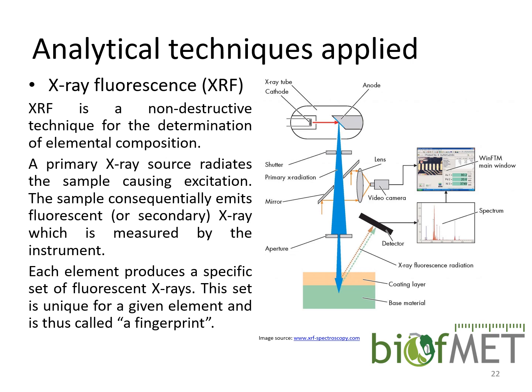So this is the main principle, and all these X-ray fluorescence techniques can be divided into two subgroups: energy dispersive or wavelength dispersive. As I already mentioned, energy dispersive X-ray fluorescence will focus on the energy of the fluorescent X-rays, so the measurements will be done in, for example, electron volts. For the wavelength dispersive, you will be focusing on the wavelengths of the X-rays, and that will tell you something about the identity of the elements. That is the fingerprint of each element.